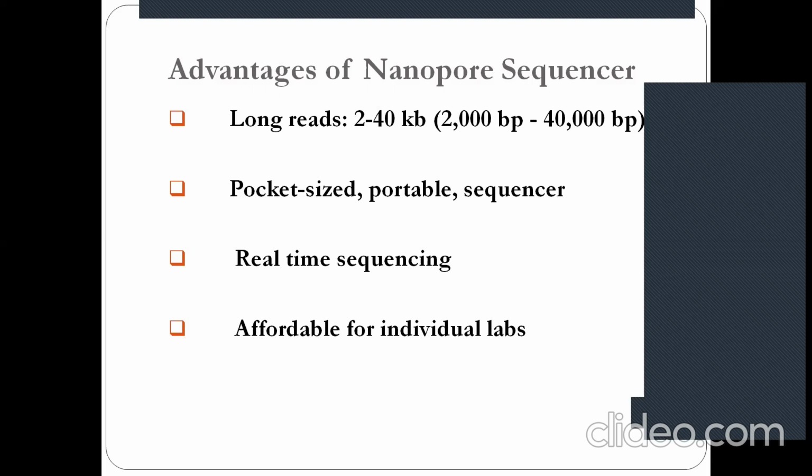So you can sequence up to 50 samples. Now the point is that in between samples, you have to follow the cleaning procedure meticulously. This is the recommended part: between two samples you have to rigorously clean your nanopores, the channel through which your sample moves from the sample vial to the nanopore.